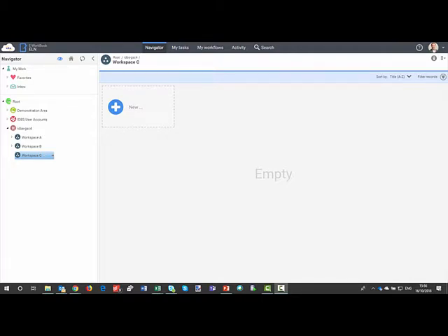In this video, you'll see how to share an experiment from E-WorkBook to Connect, and you will see how that record transfer process takes place. So let me just talk a little bit about what you're seeing at the moment.